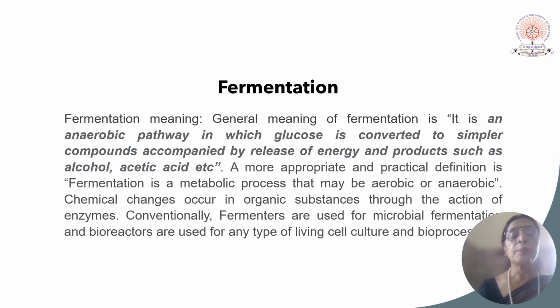One meaning of fermentation is that it is an anaerobic pathway in which glucose is converted to simpler compounds with the release of energy. A more appropriate and practical definition is that it is either an aerobic or anaerobic process during which chemical changes occur in organic substances through the action of enzymes. Fermenters are used for microbial fermentation, and bioreactors are used for any type of living cell culture and bioprocessing.